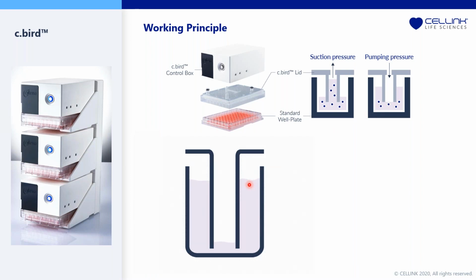So as shown in the video, here you can see the medium can be pumped up and down by supplying the suction pressure and pumping pressure to do the reciprocating mixing in all the wells in parallel.